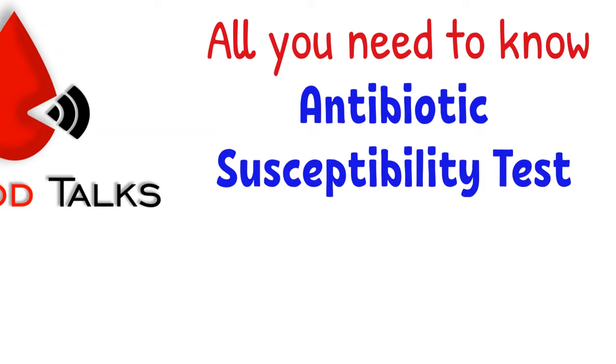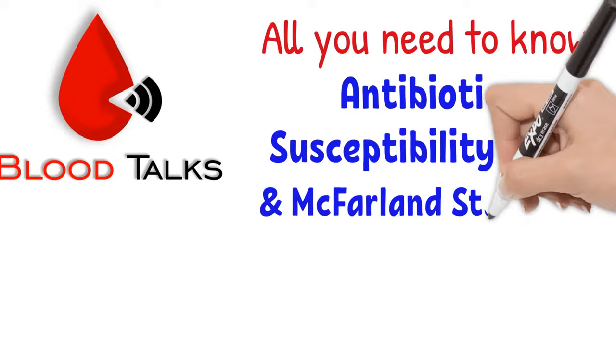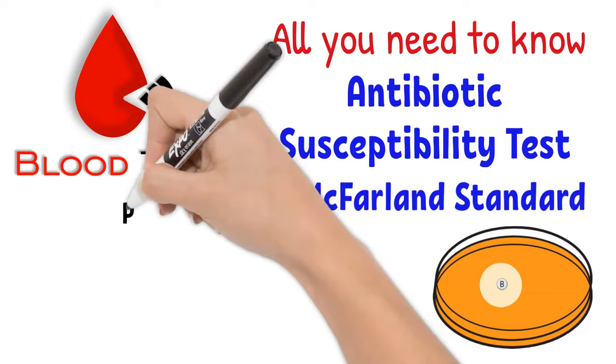Therefore, we will be talking about antibiotic sensitivity tests by Kirby-Bauer methods or disc diffusion methods today. I will include how to make McFarland turbidity standard to prepare for inoculum in this video as well.